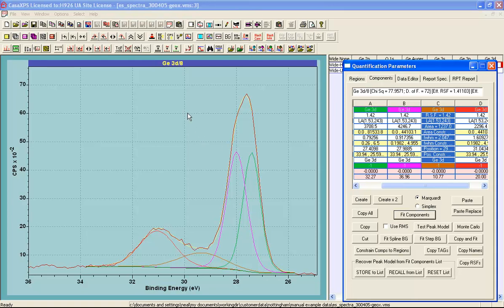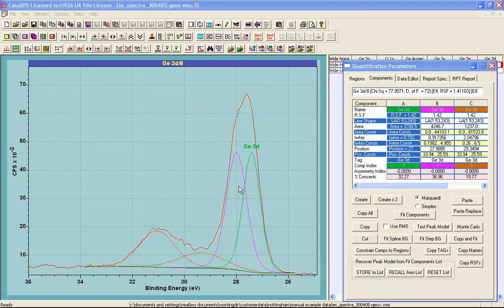3D doublet. The existence of doublet peaks in XPS is because the XPS process creates a hole in a set of electrons that initially all have the same energy. So in the case of the d orbitals, there are 10 electrons all with the same energy, but once an electron is emitted, the coupling of the spin and the orbit then means that in the ion that is created there are 2 different energy levels possible, and the states that are available within the ion means that the 10 states that were all equivalent in the atom are split into 2 sets.